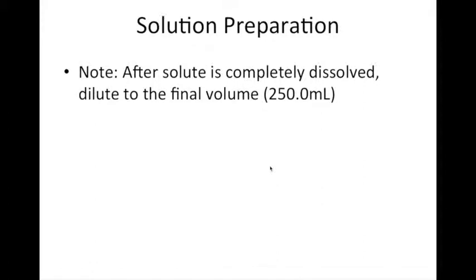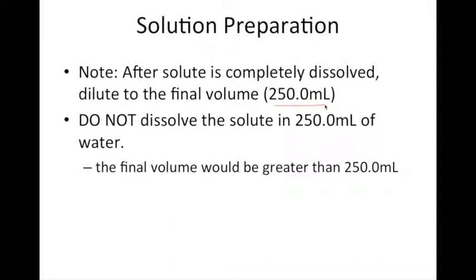Now, one thing that's important to note, notice the steps very carefully. Be sure you have written these down. Be sure you're taking notes. When you prepare a solution, you dissolve the solute first, and then you dilute it to your final volume. In our example, we diluted it to 250 mL. Never take your solute and dissolve it in, in this case, 250 milliliters of water.